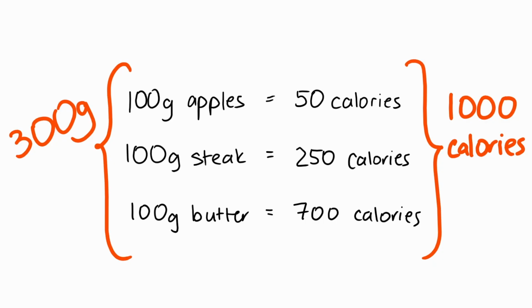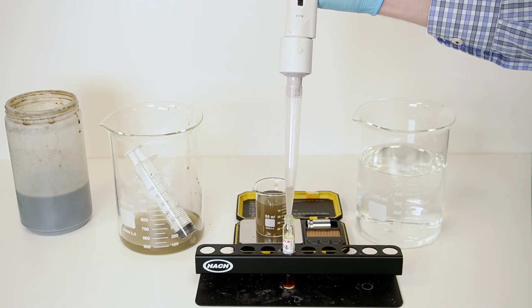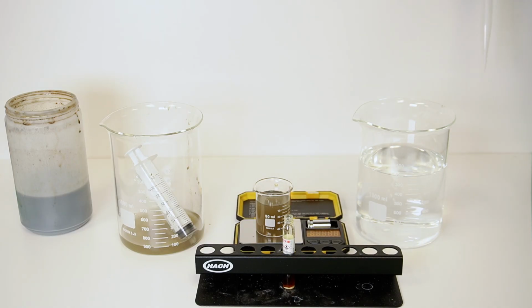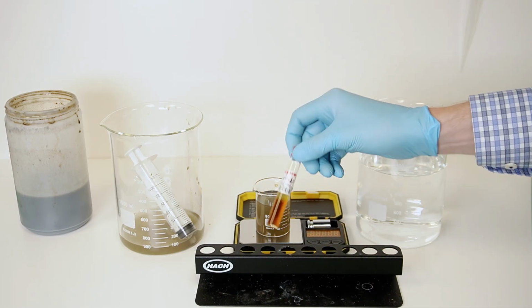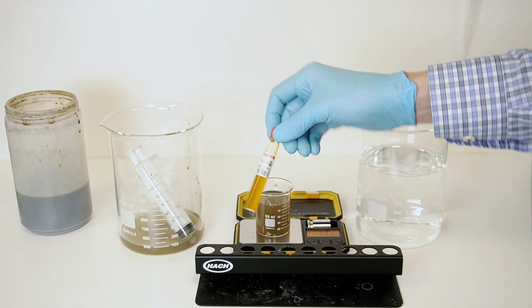Since the COD test is a direct measurement of the energy value of your feedstocks, it's theoretically a more accurate way to tie your organic removal rate to your biogas production. But the COD lab test is finicky. You've got to pipette a small volume into a teeny vial. That's fine if you've got uniform and well-blended material like milk and spoiled beer, but not so much for chunky soup or non-uniform material like food waste. There are ways to increase accuracy, but that's for another discussion.